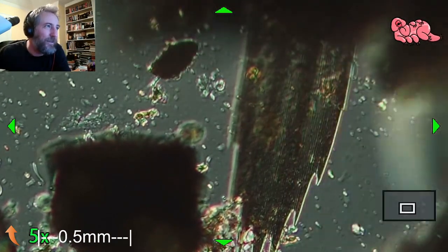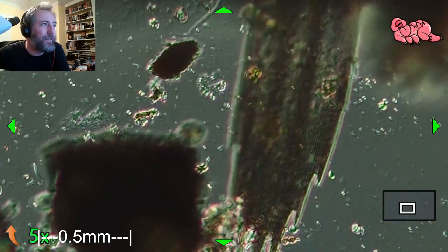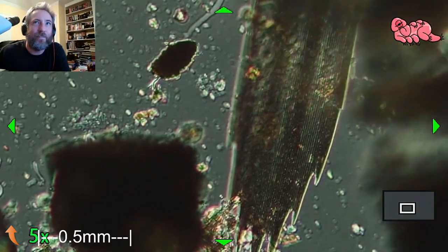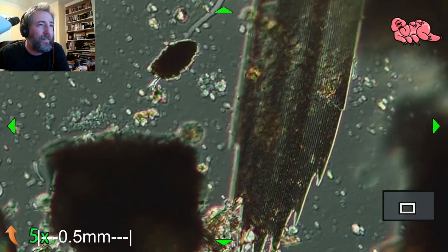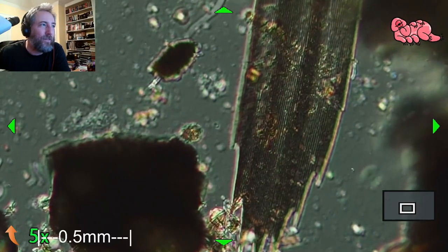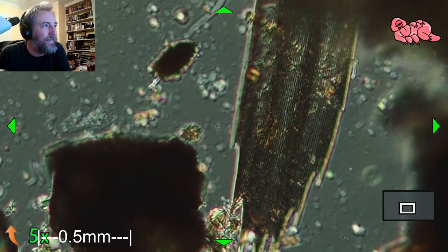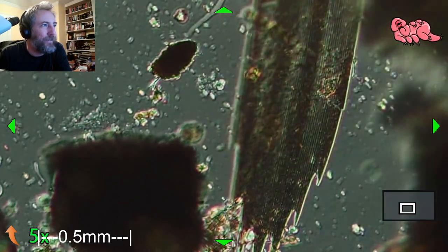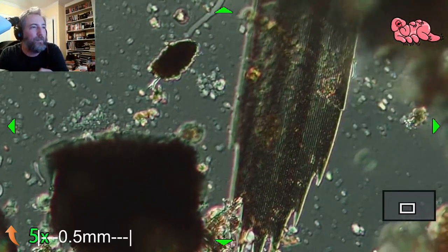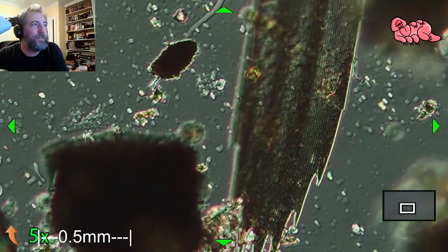That is a butterfly scale, or potentially a moth scale. People don't realize it, but butterflies look like they're furry or hairy sometimes. And moths are the same way, but all of those are actually just modified little scales. And that thing right there is a tiny little butterfly scale. Like on their wing, they're covered with these little tiny scales and they make all the colors. That's the actual scale of a butterfly right there. And I can tell just because I've seen them before.